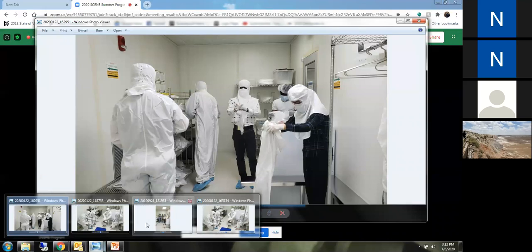However, if you wear it the first time and then you spill photoresist on it, you need to take that garment out of circulation or put it in the laundry basket and get a clean one, because that photoresist is now contaminated your garment.